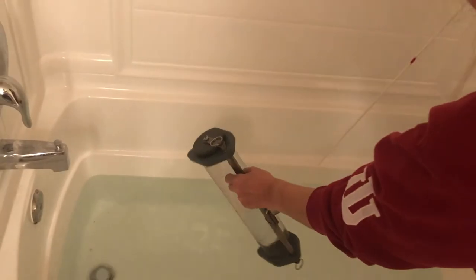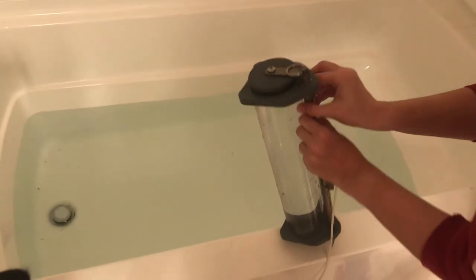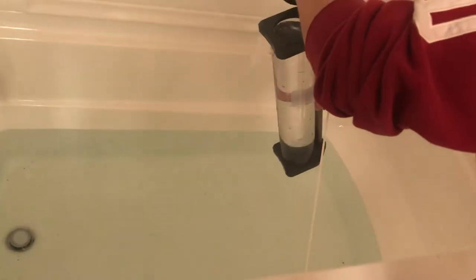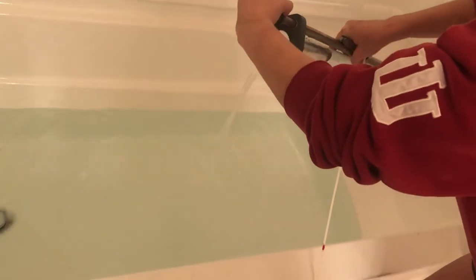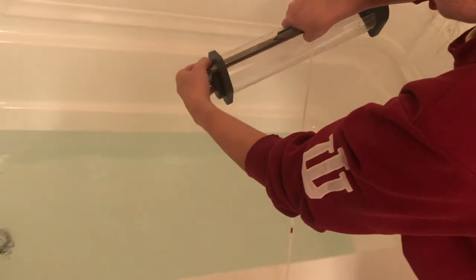And we have our water sample. In order to get the water out, move the messenger. We just open one side of this, and then we can pour that into our container. And then we repeat.